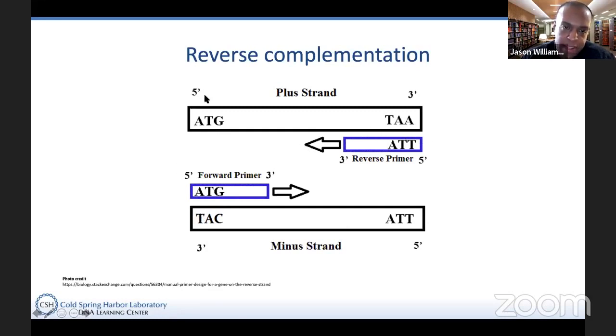If you think a little bit deeper, remember how I told you that the very beginning and also the very end of your DNA through sequencing often have low quality? Do you recall why? The very beginning often has low quality because of the molecular weight of the DNA: strands of replicated DNA that are only 5, 10, or 20 base pairs tend to smear.